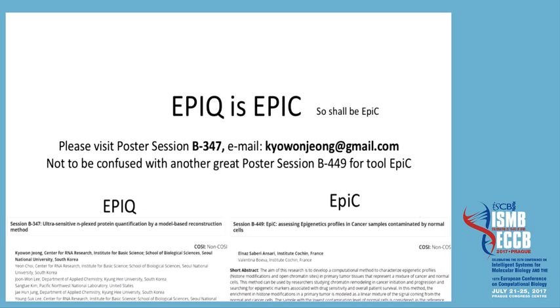Okay, so in LC-MS proteomics, proteins are digested into peptides. Each peptide has an N-term and a C-term. At the N-term, the label is attached, and if the peptide ends with lysine, there will be an attached label there too. So two possibilities. Yes, diethylation. If you visit the poster, you can see the details.